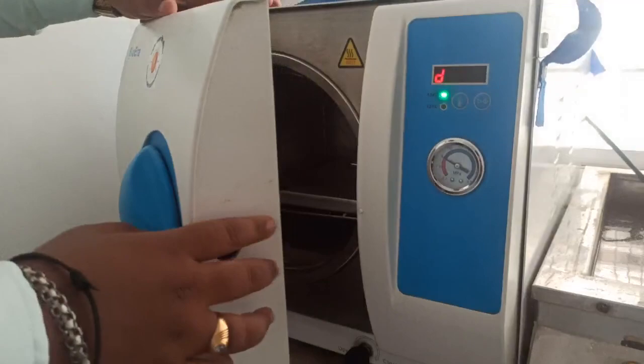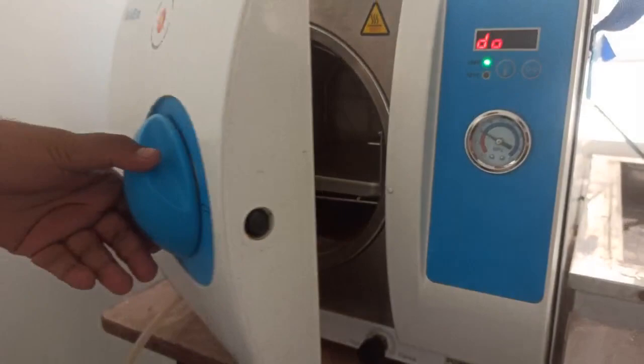I hope you understood the whole mechanism of this digital autoclave from Biovera. If you have any doubts regarding this, please do comment in the comment section below. Thank you.